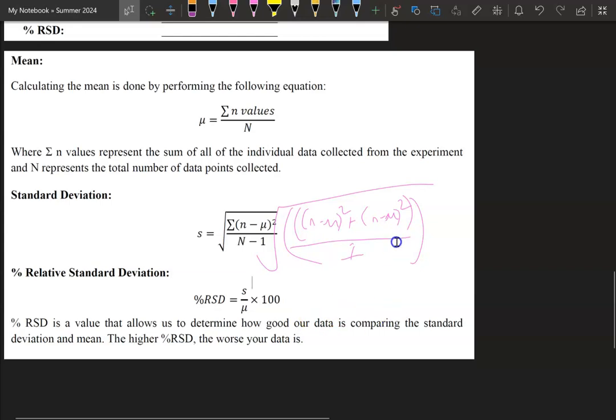Now, you do not want a large standard deviation, because a large standard deviation means that the group numbers are spread very far apart. What we want are the numbers to be relatively close together. Now that's difficult because each of our groups are doing our own thing, and each group will make an error, and then that shows up in the overall result.